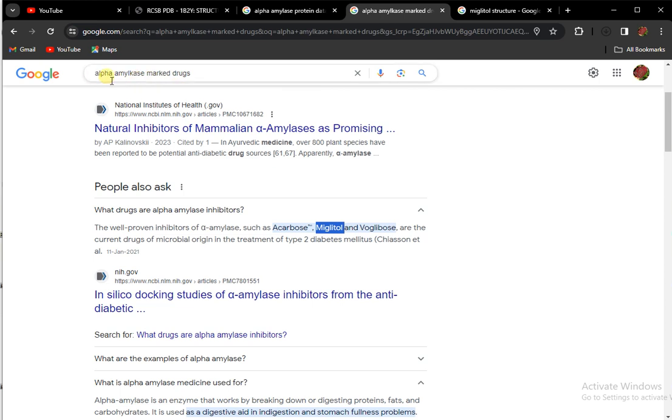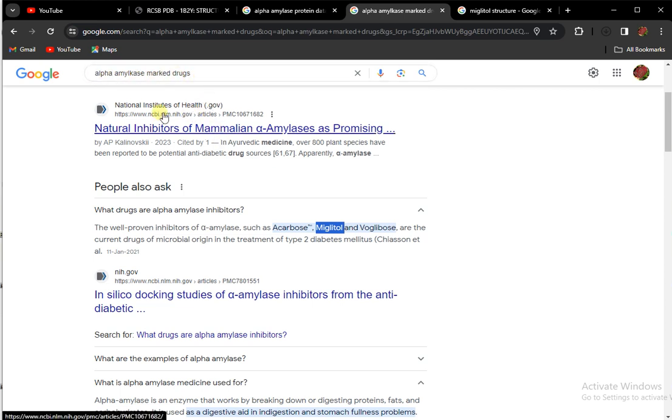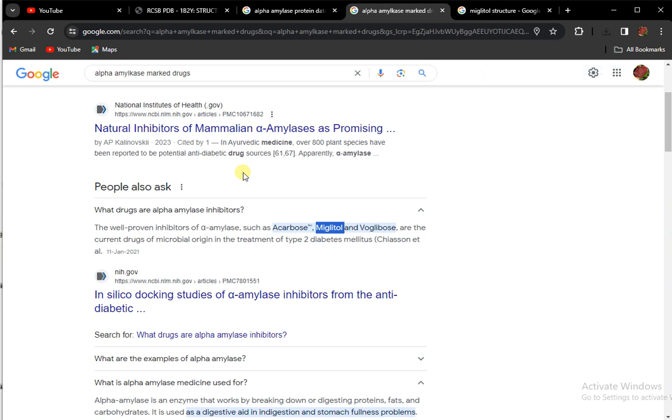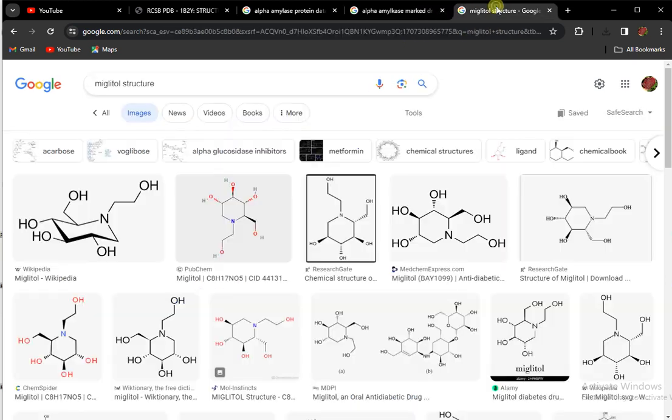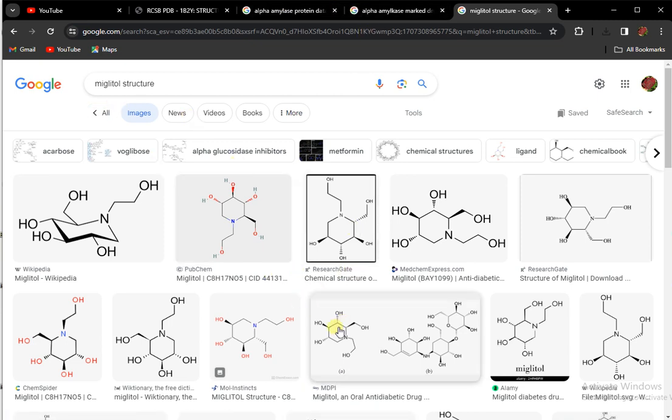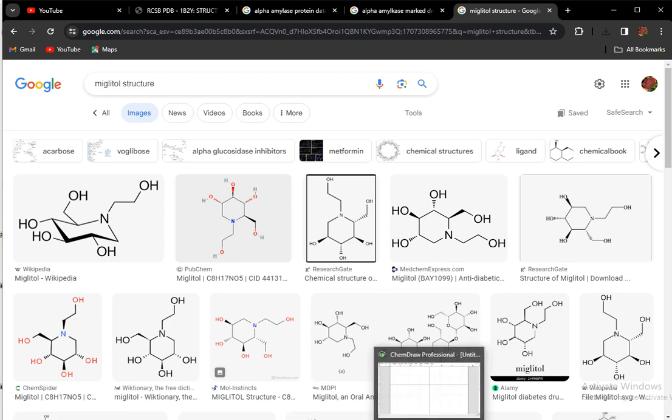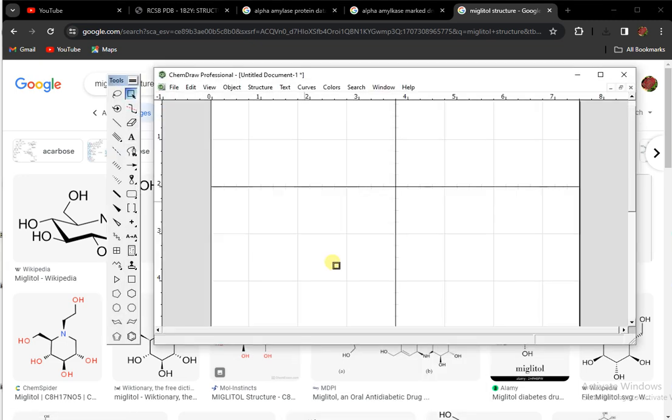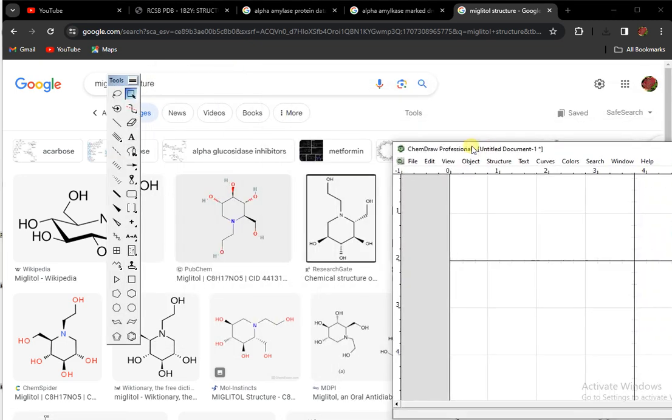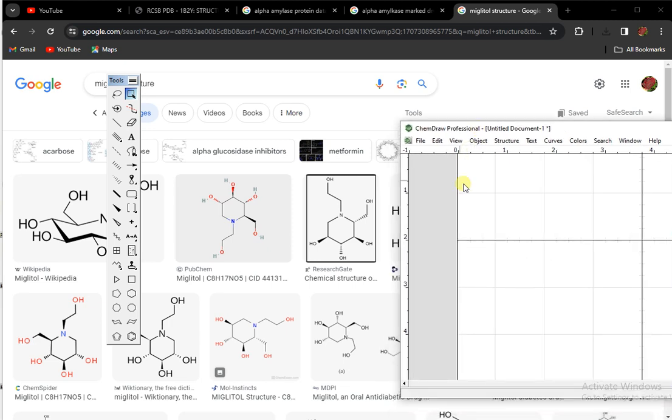For alpha amylase marketed drugs, either you search for marketed drugs or search for inhibitors available. If marketed drugs are not present, I simply copy this and search the structure of this inhibitor that is used for alpha amylase inhibition. First of all, I have to draw the structure of this drug that I use as a standard.